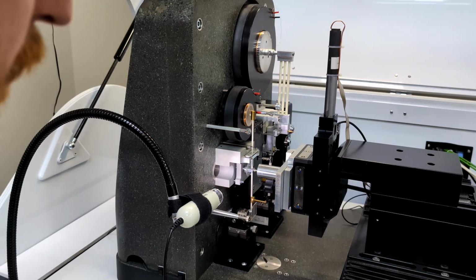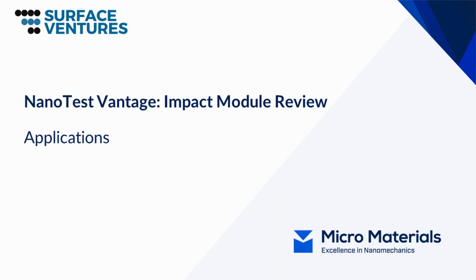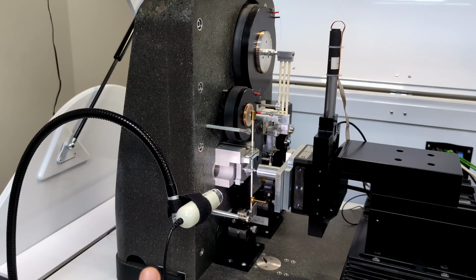The optical microscope, seen at the very rear of the system, can be used to look at specific areas on the sample to test with a repositioning accuracy of better than 0.5 microns. The micro and nano impact modules can be used to predict coating performance under erosive conditions and also can mimic the repetitive contact in end milling.